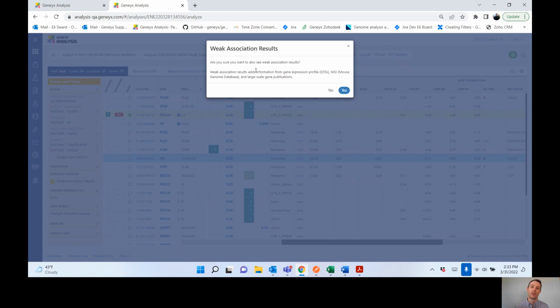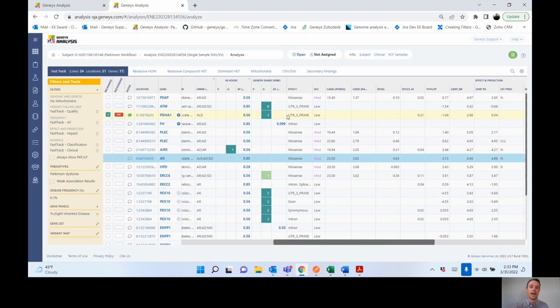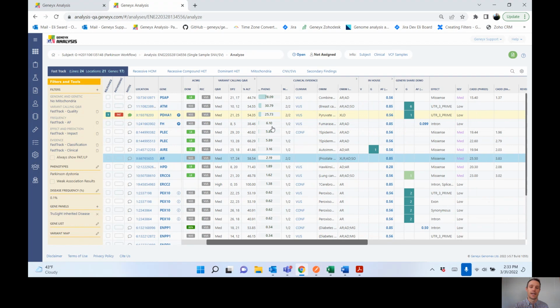And so with more information, we're getting a broader scope of the gene phenotype association. So it's ultimately going to impact your phenotypic score if you enter in a particular phenotype. But again, this is for non-clinical use. If you wanted to get a broader understanding of the gene phenotype association, this would be a great feature to integrate into your particular workflow.